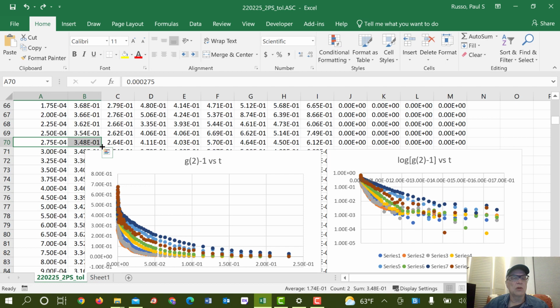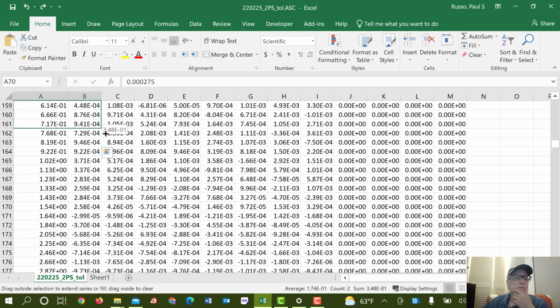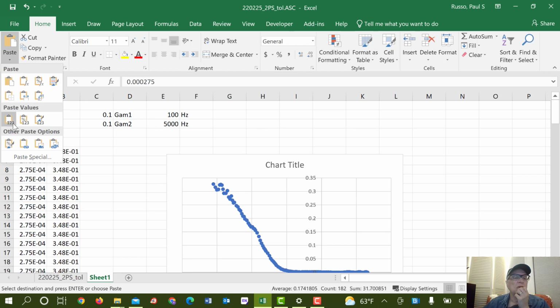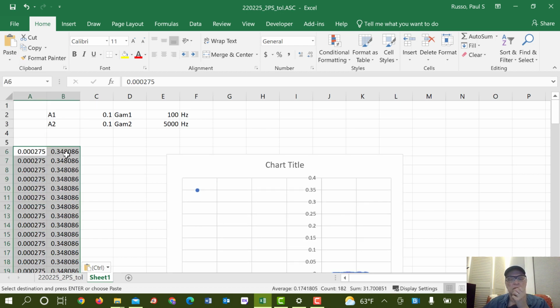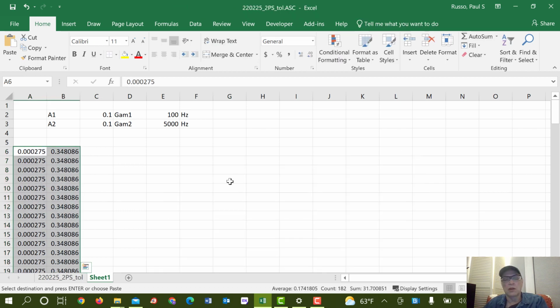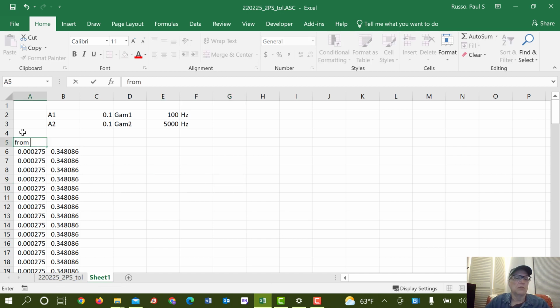So I'm going to come from here, and I said down to 160. New spreadsheet. I'm going to paste this as values. I apparently already had something here, which is kind of handy. We're going to do paste as values. It does something to that plot that I don't like, but who knows what it did to that plot. It's okay. I'm going to get rid of that plot anyway. So these are going to be our values, and we're going to make a note from 70 to 160 channel row numbers.